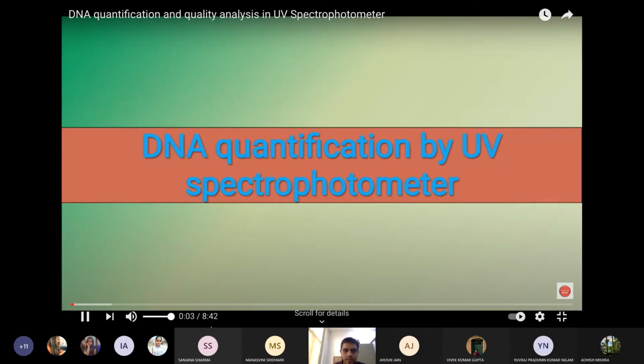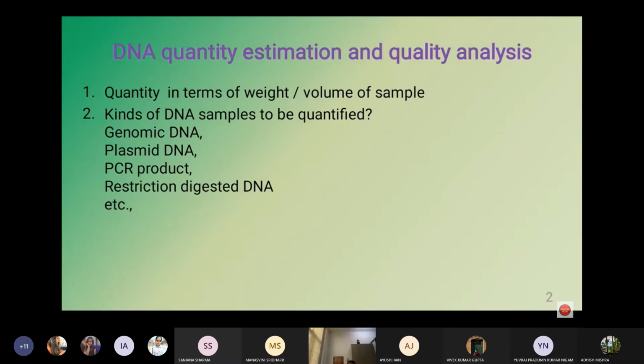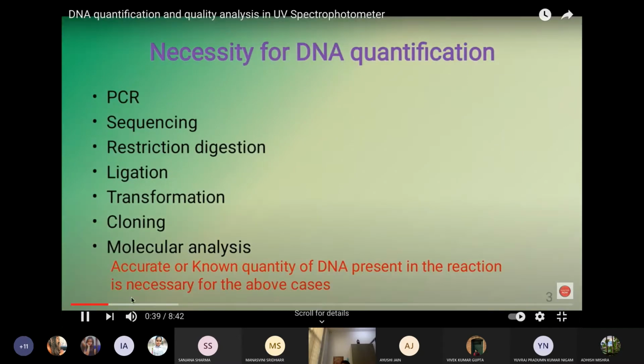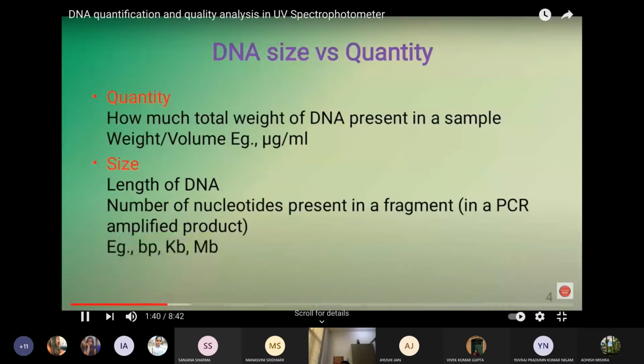We will see about DNA quantification using UV spectrophotometer. DNA is quantified in terms of weight by volume of sample. After purification, DNA is generally resuspended in TE buffer or deionized distilled water, and hence the quantity is measured in the unit weight by volume, either microgram per ml or nanogram per microliter. Different kinds of DNA samples are quantified, such as genomic DNA with very large size, plasmid DNA, PCR products, restriction digested DNA, single stranded DNA, and small oligomer DNA. Accurate quantity of DNA is necessary to perform several molecular biology experiments, and how much DNA is present in the reaction is necessary. It is represented as number of base pairs.